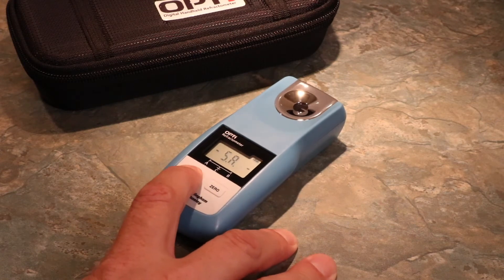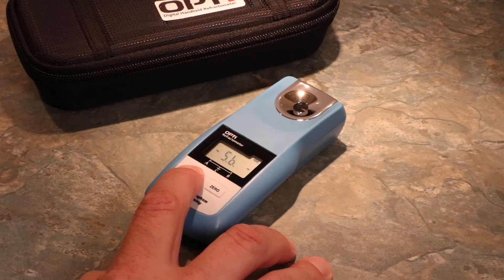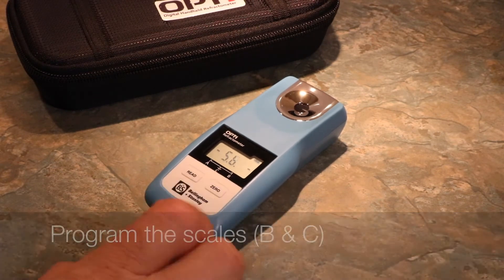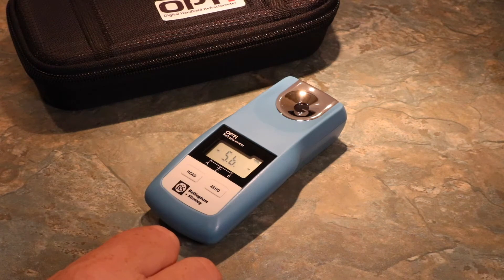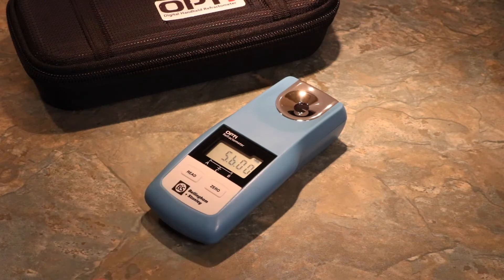Here we can see Scale A is loaded with the Brix Scale. Scales B and C are currently unassigned. Within the menu, use the Zero button to locate the parameter that you wish to change. In this example, we've stopped at Scale B and pressed Read to confirm our selection. Scale B is currently unassigned — we know this as it is represented by a zero.